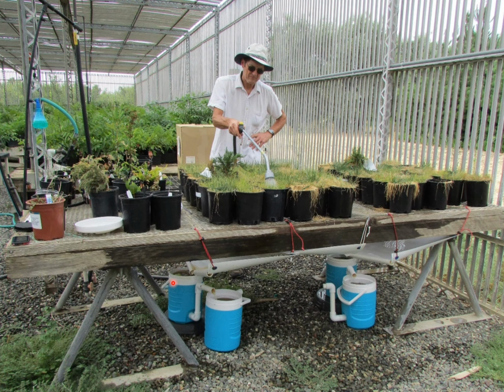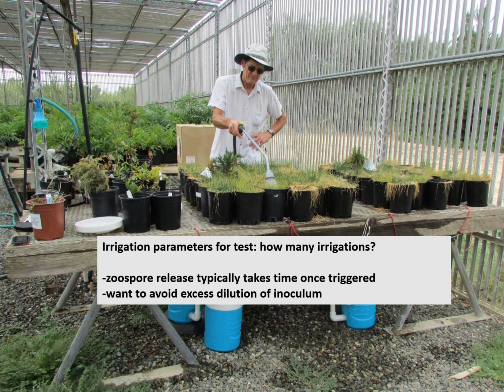This slide shows another one of these types of experiments where we're taking the runoff from one vessel and running it through a second one to get an idea of how many zoospores are passing through the first one. Besides optimizing the equipment itself, we still had some other questions, and one of those is how do we irrigate these things? And how many times do we want to irrigate them?